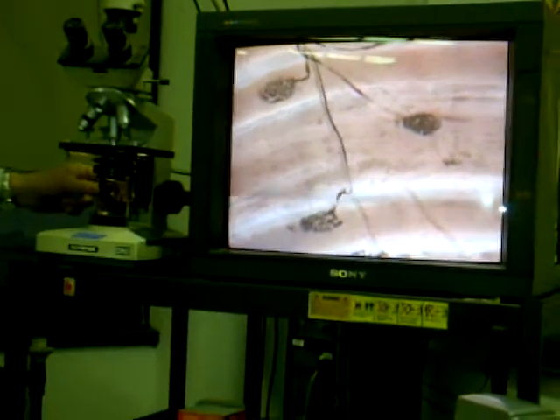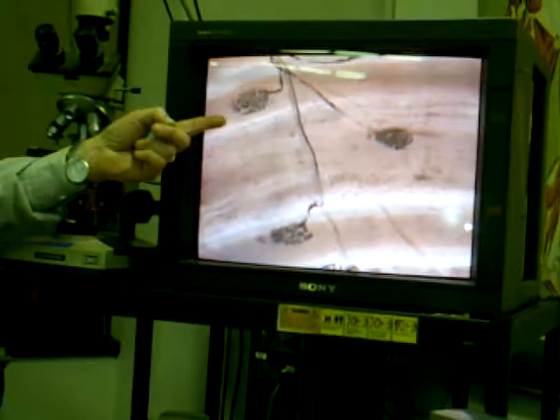And they look kind of blotchy and black because what the stain is staining is the chemical substance that actually transmits the impulse from the nerve to the muscle. It's called a neurotransmitter, a compound called acetylcholine. But that's what stains. So this is one of those examples where everything is just perfectly stained to show the function and the structural connection very clearly.